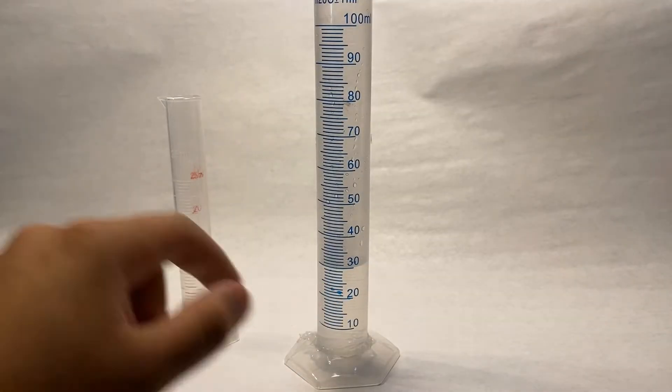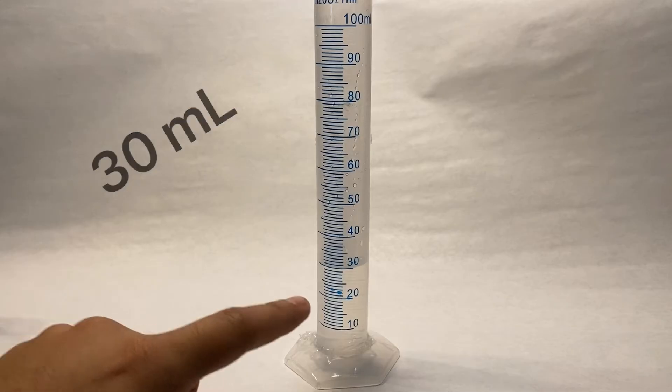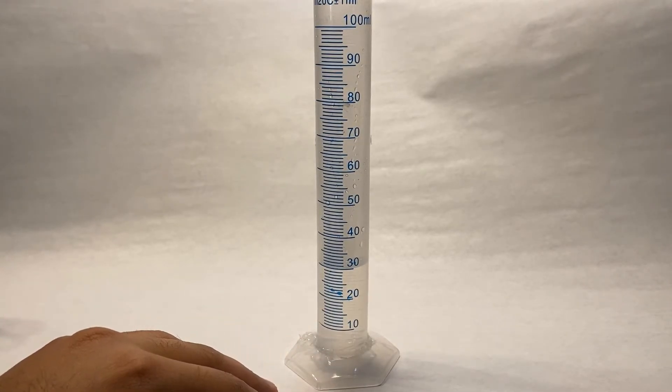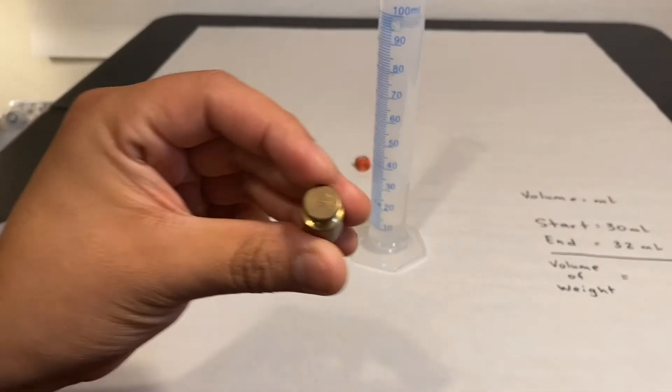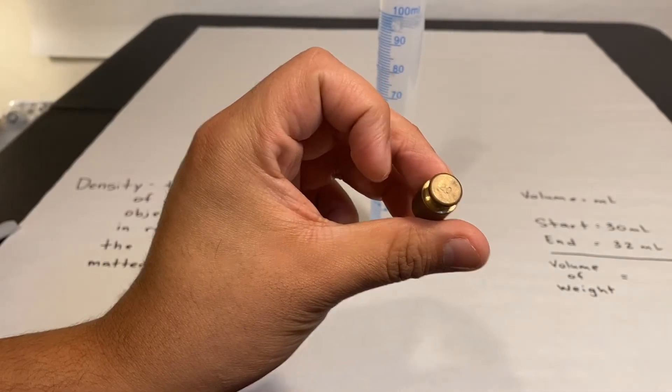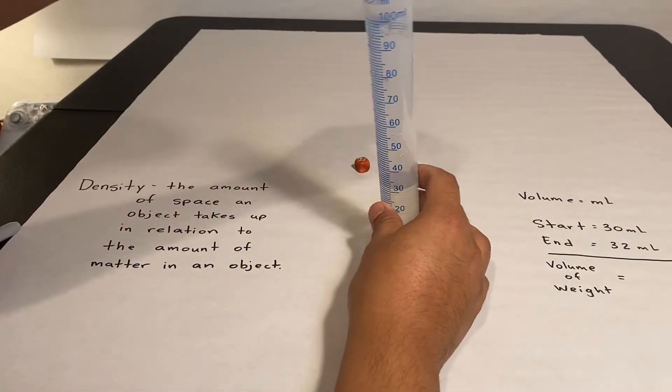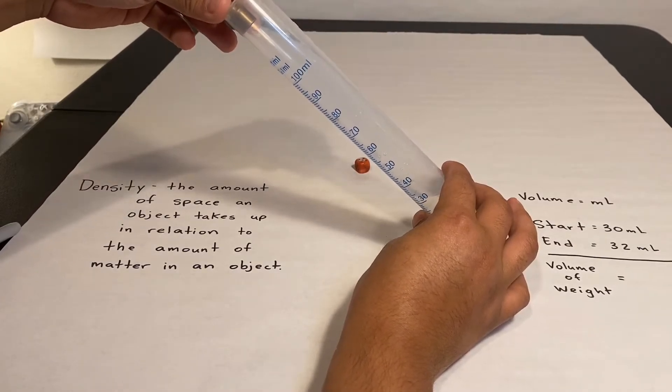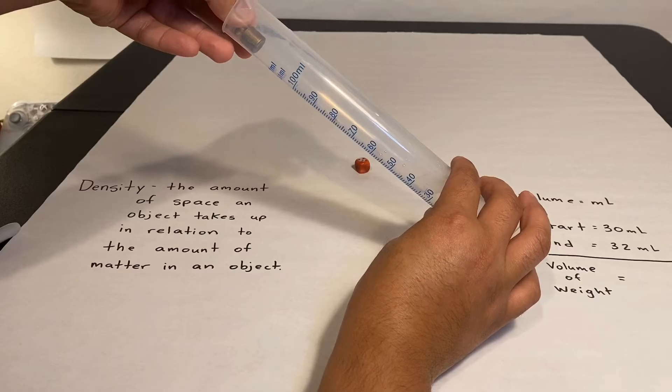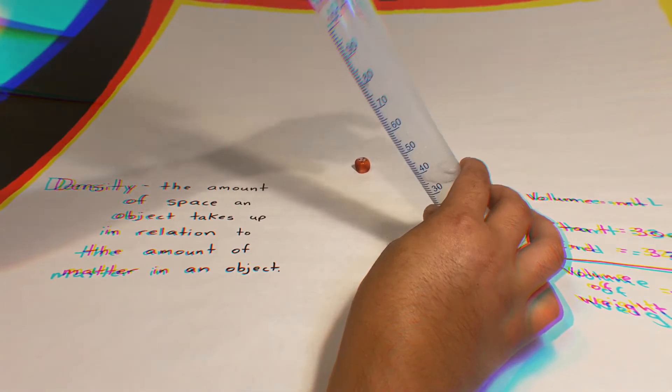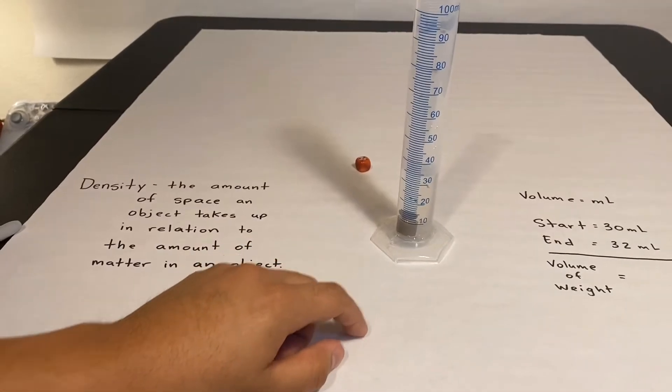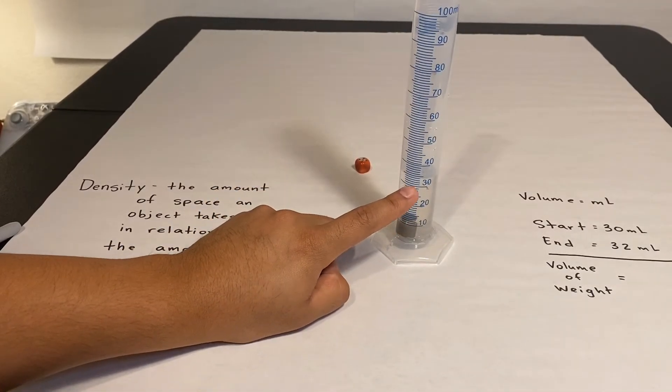Now right now I have 30 milliliters in the graduated cylinder. Now how am I going to measure the volume of an object? Drop this 20 gram weight into it. I'm going to tilt the graduated cylinder so make sure it will not splash.